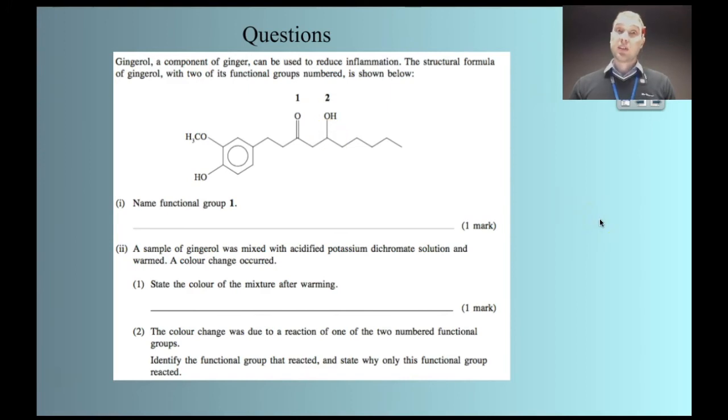So today on Flipping Science, we looked at the reactions of alcohols, and we also looked at testing aldehydes using Tollens reagent.